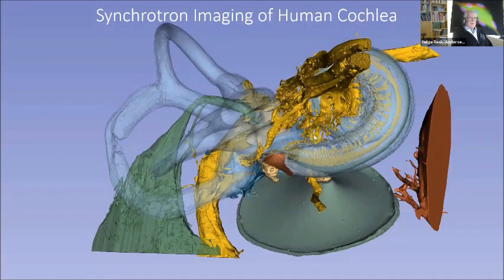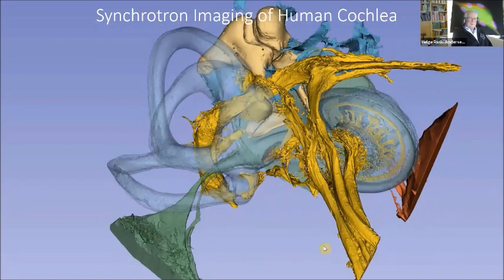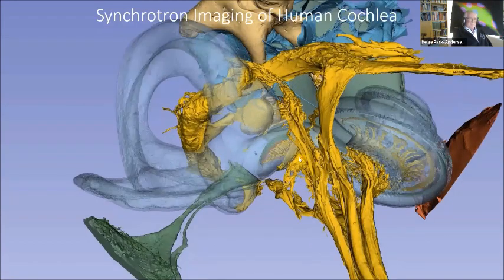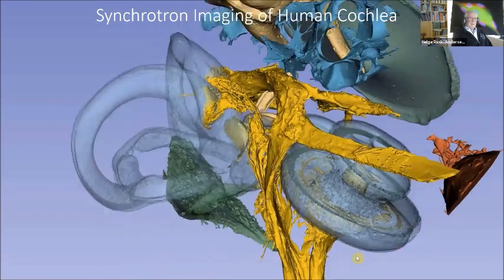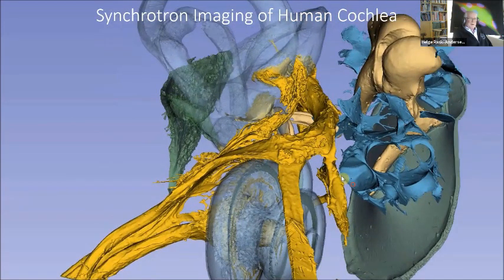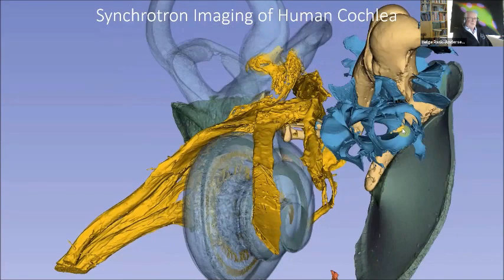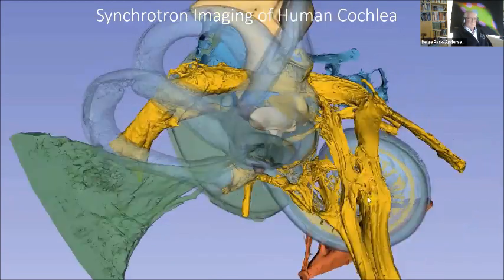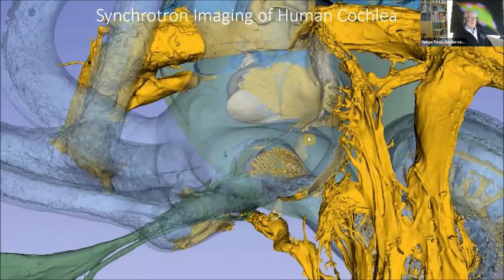Now, this is a synchrotron image, and thanks to Sumit, by rare chance, he came to my anatomy course here some years ago, and I was so happy to present the micro CT, so proud, and then he said, well, we do synchrotron. I said, what's this? Show me. And then he showed this fantastic resolution he got back in Canada, and we started collaboration ever since. And that's fantastic for us in Uppsala to have this collaboration with Sumit and with his collaborators.